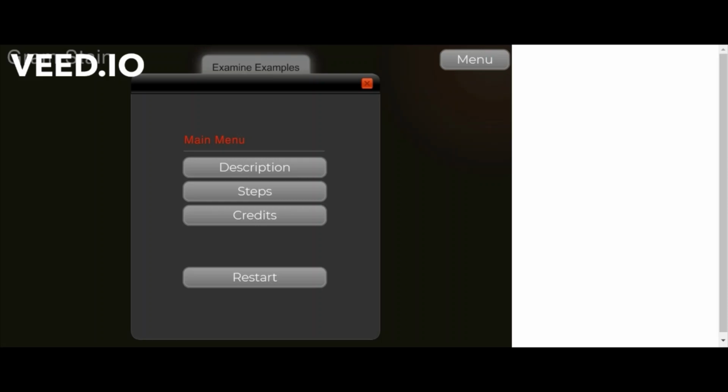Basically, there are 4 important steps in this gram staining. The first one is primary staining, which uses crystal violet. The second step is the mordant stain, where we will use iodine. The third one is the decolorization step, which uses alcohol, and the fourth one is the counter staining, which we will use safranin. So I will start with the experiment.